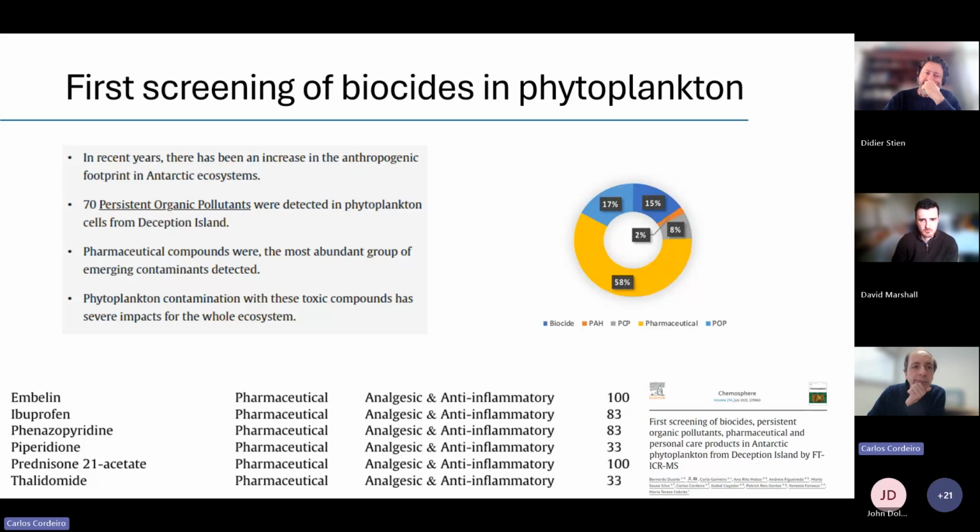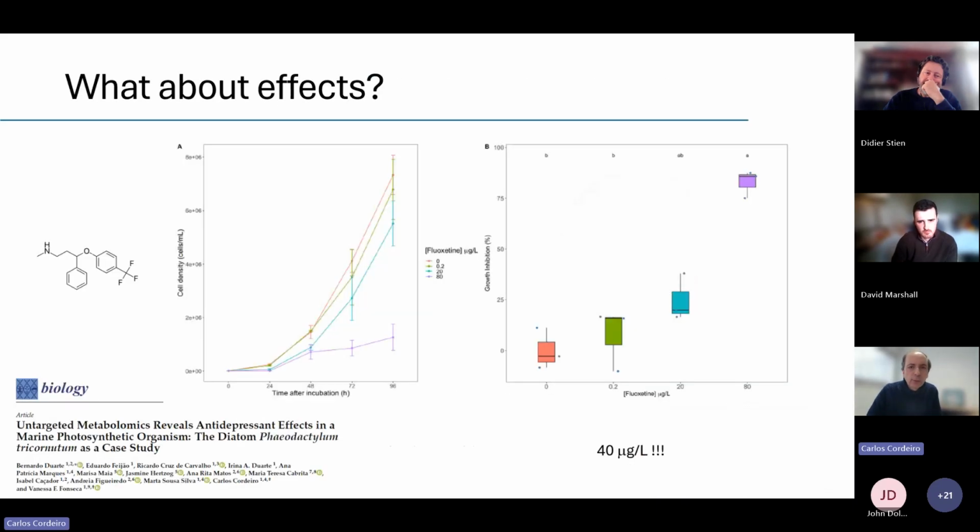And this is exactly what we did here with the fluoxetine, which is also known as Prozac. And this thing has been detected in seawaters at concentrations that in some cases can reach as high as 40 micrograms per liter. Usually the detectable concentration is much lower, usually in the nanogram to picogram range, but what is quite worrying is that I think this kind of substance is detected more or less everywhere. And I'm pretty sure that in the list of annotated compounds that Didier just showed, this thing is there too.